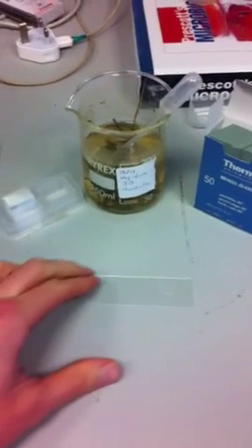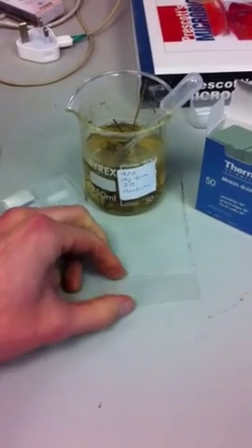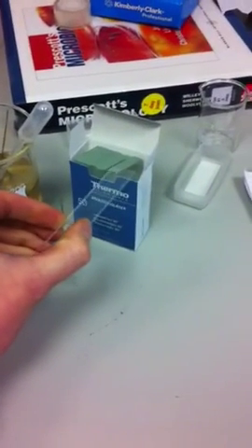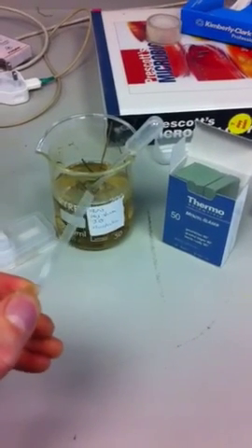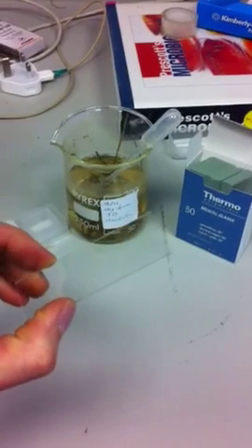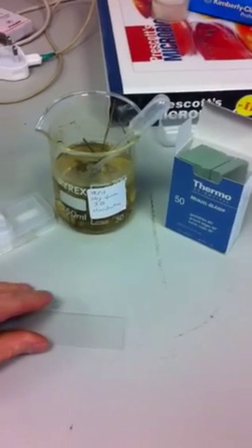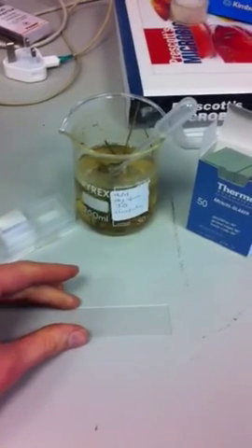So first we've got a slide here, from this box. They're quite delicate and they can break quite easily, so be careful with them.